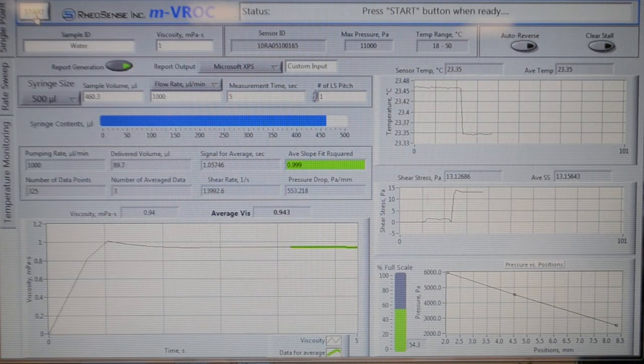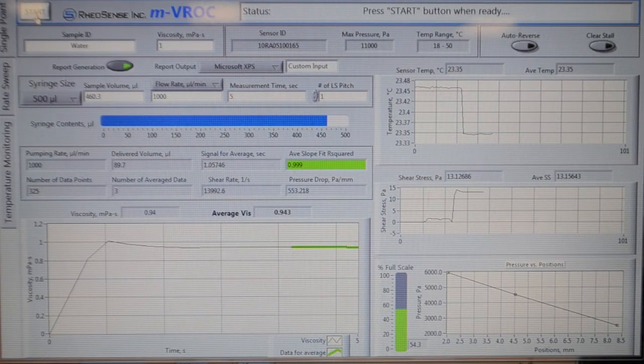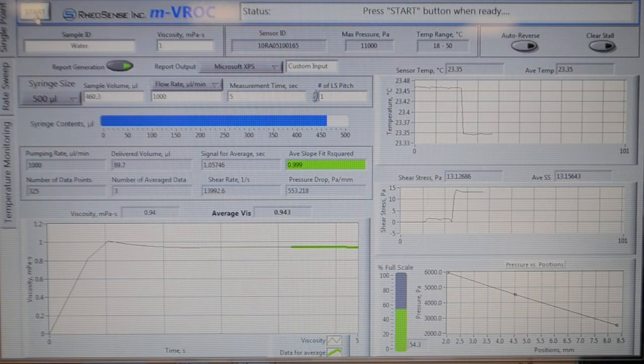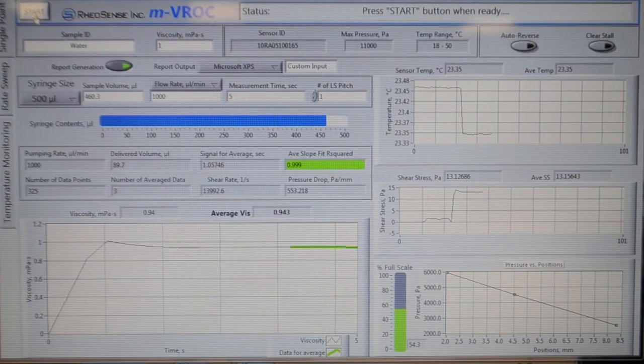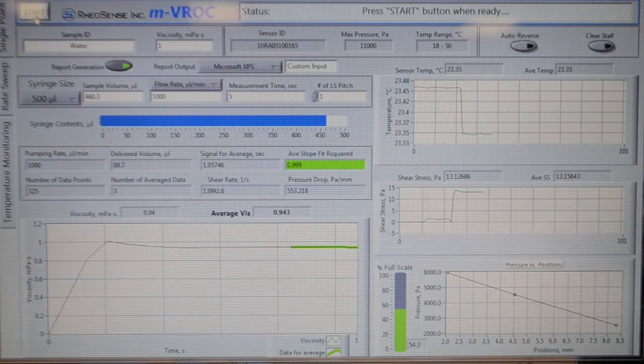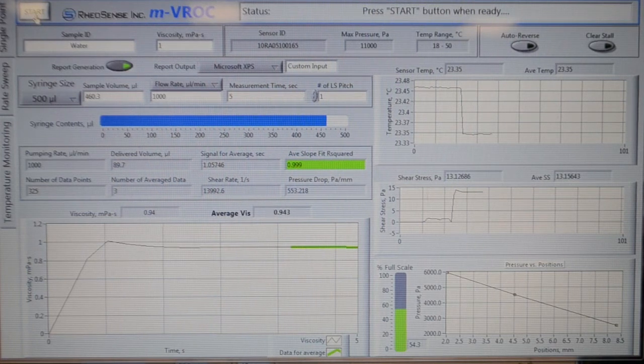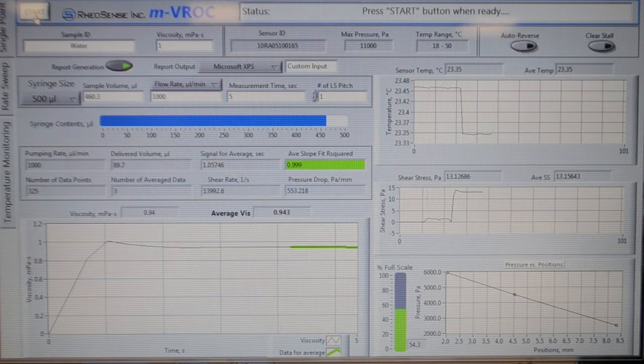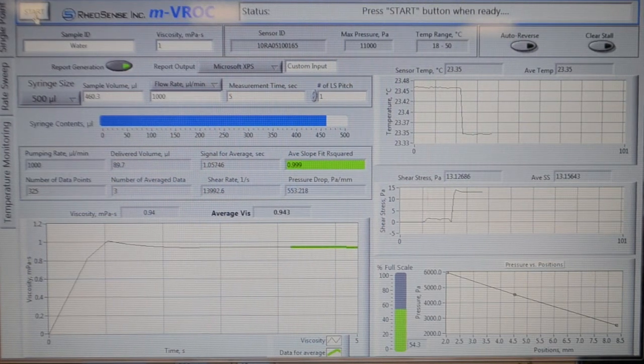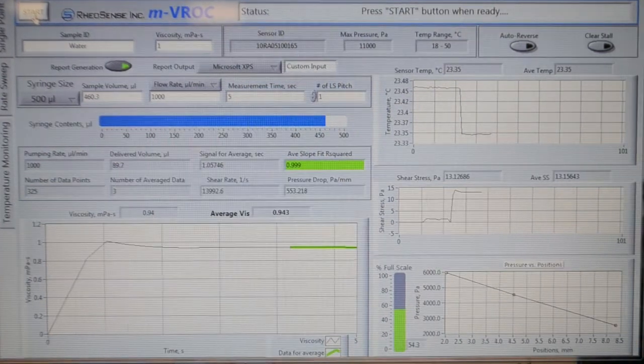Also, make sure the R-squared value is either 0.999 or 1. Otherwise, this can imply there are still air bubbles in the chip, and you will have to repeat the sacrificial run until the R-squared value approaches 1.